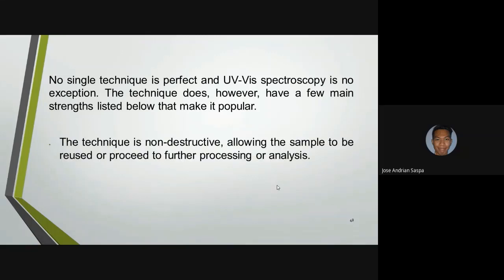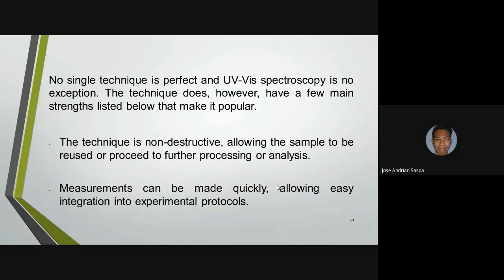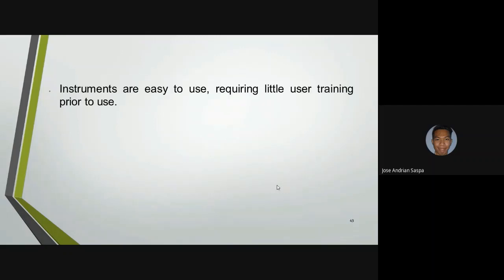Okay, so the technique is non-destructive, allowing the sample to be reused or subjected to further processing or analysis. So if we are not satisfied with our results, we can reuse the sample to have another trial. Measurement can be made quickly, allowing easy integration into experimental protocols. And then instruments are easy to use, requiring little user training prior to use.